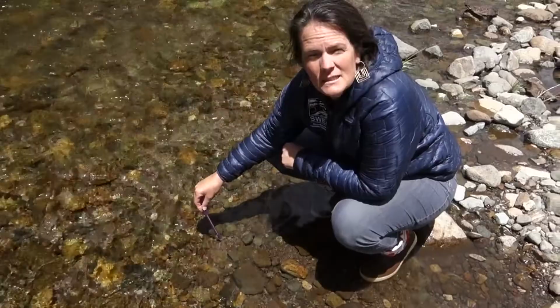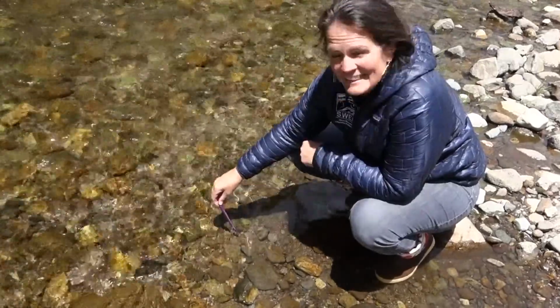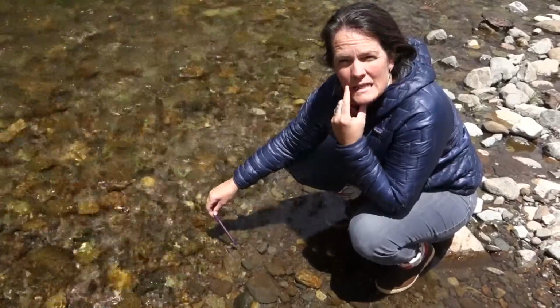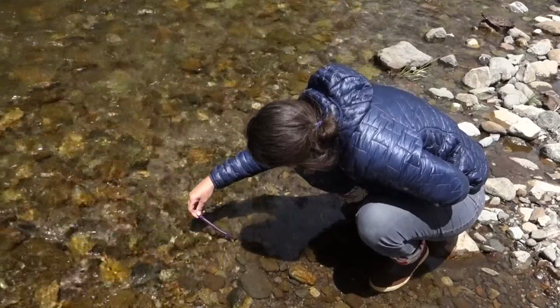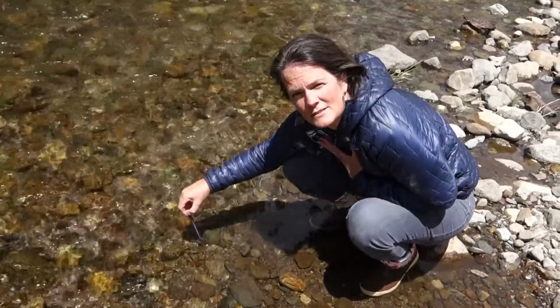Okay, to collect the water temperature, you're just going to put the probe of your thermometer, that bottom part, in the water and leave it there. You're going to be looking for the level of the fluid inside the thermometer, wait till it stops moving, and then gather that temperature data. So for me, our water temperature is reading at 11 degrees Celsius.